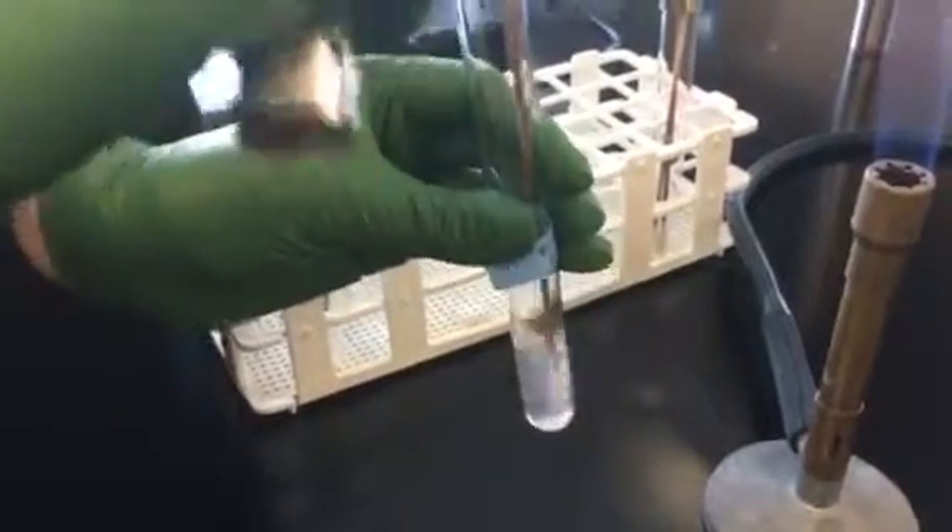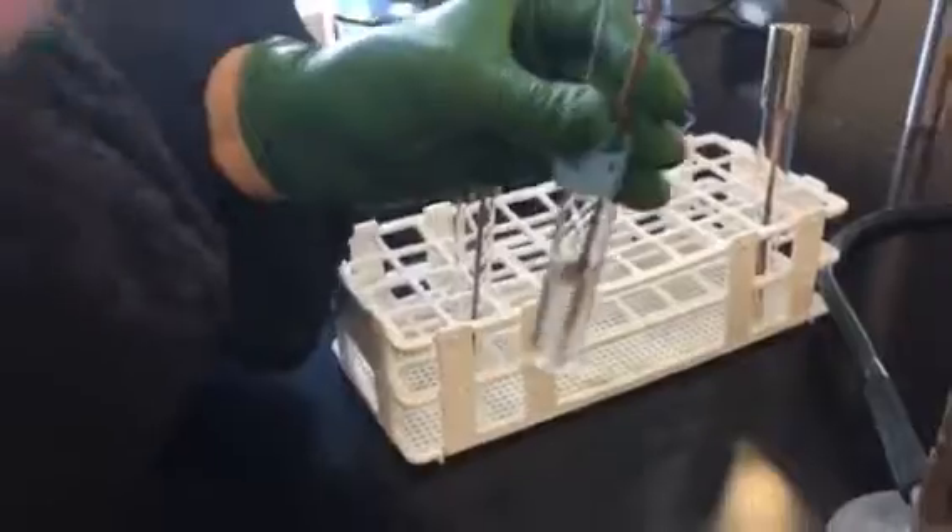Try to shake the swab around as much as possible to get the bacteria into the liquid. You'll see that it's becoming slightly more cloudy. You might need to add more bacteria if it's not cloudy enough.